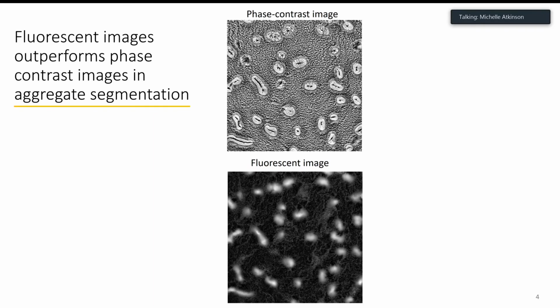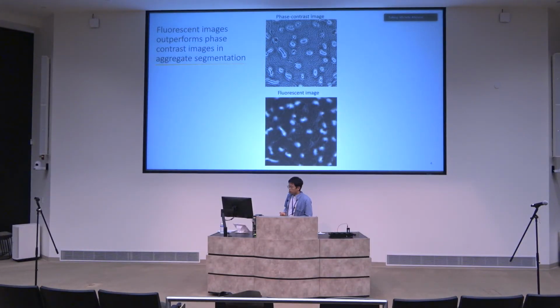Although the phase contrast microscope enhances the contrast, it also introduces some artifacts, like halos at the boundary of the objects or shade-off in the middle of the objects. This may obscure the object of interest.